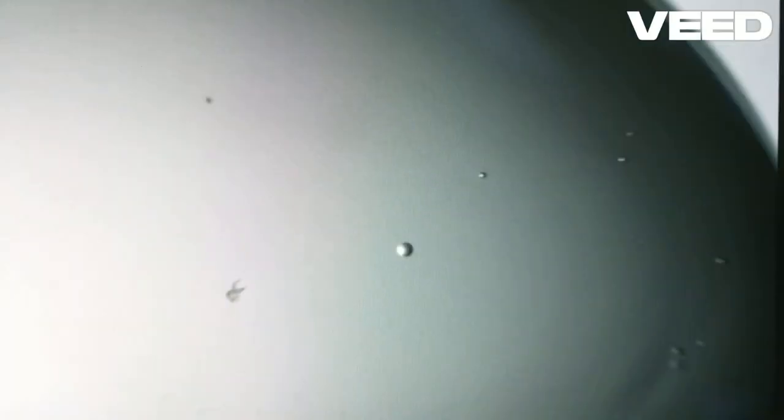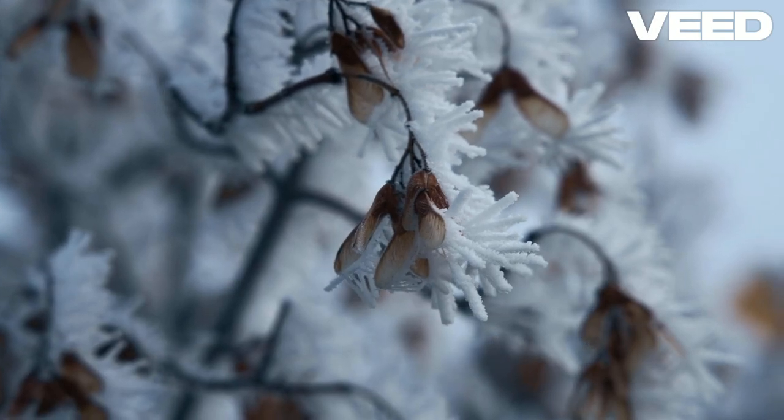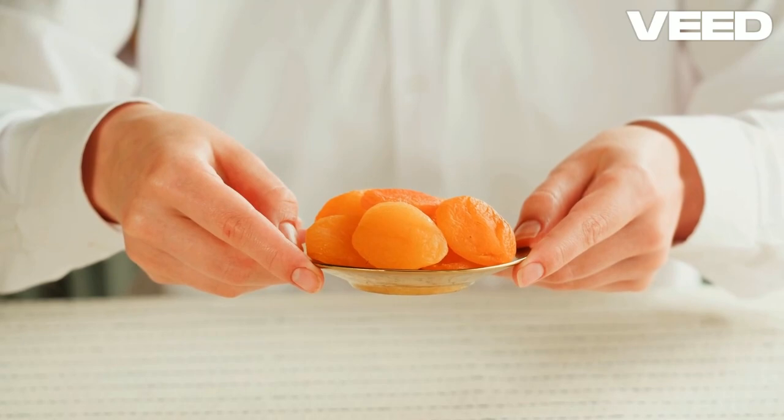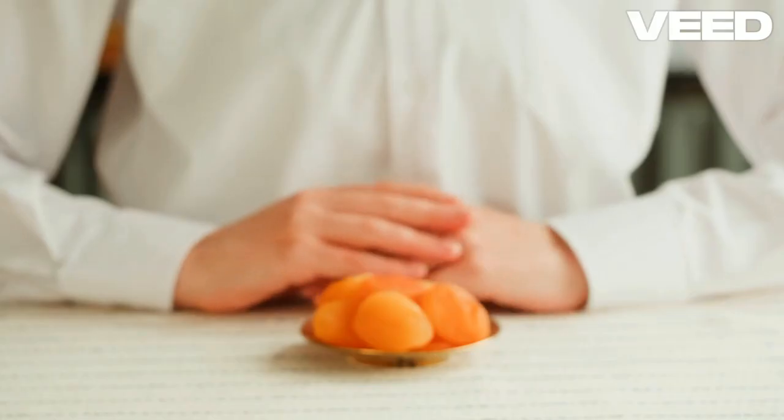Preservation at very low temperature involves suspending microorganisms in nutrient broth with glycerol, freezing them at -15 degrees Celsius to -30 degrees Celsius, or in liquid nitrogen to drastically slow down metabolic activities.